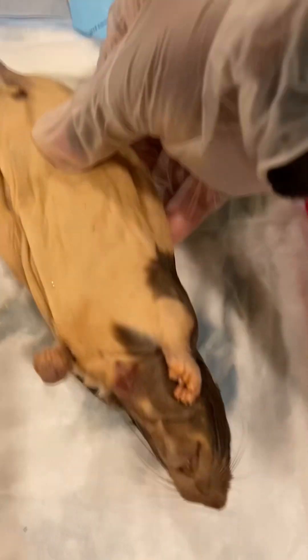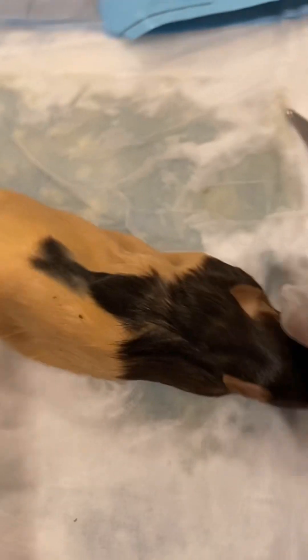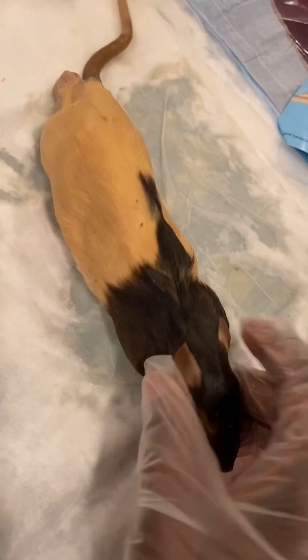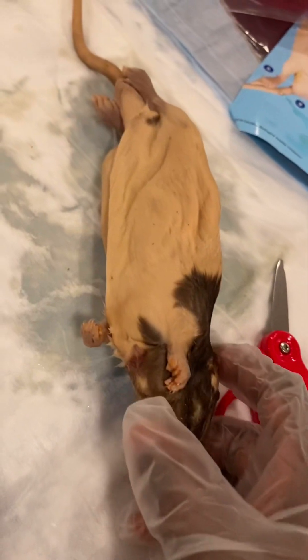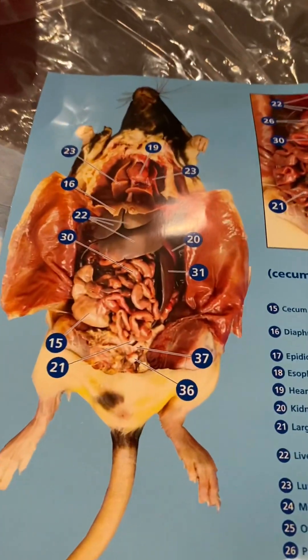I'm going to show you how I did the assignment on rat dissection. Keep on watching to the end — I hope you're going to enjoy this video. For those who don't like this thing, please funga macho, skiza tu sauti. Drop a comment and let me know what you think.